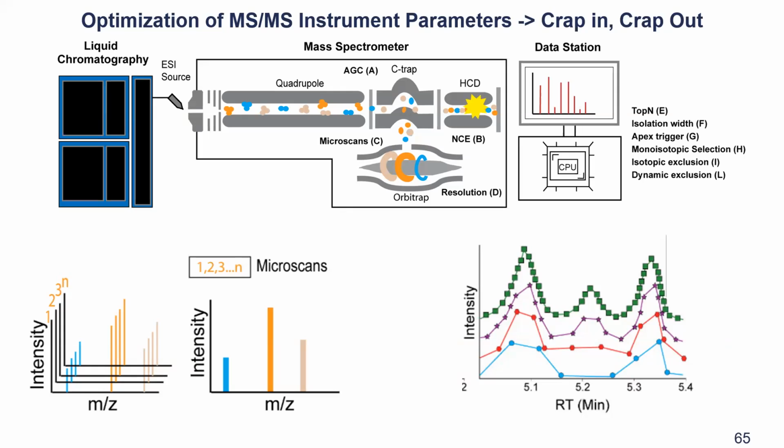And then when you want to use feature finding, for example, with MZmine, that you will learn tomorrow, this has some ramifications in that the algorithms do not work very well. So not only from an MS2 perspective, where you want to have enough coverage and proper intercycle times, but also to actually have enough MS1 survey scans to display the chromatogram properly. So again, here's the balance, and depending on how long your HPLC separations are and what kind of columns you use, this needs to be adjusted to your particular setup.